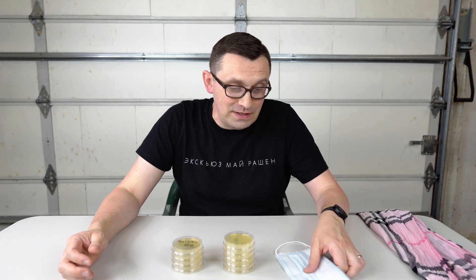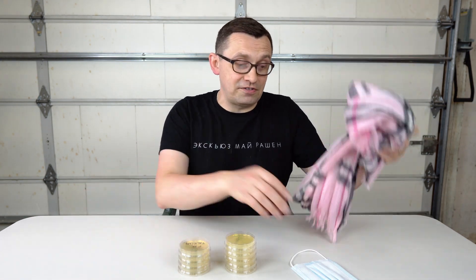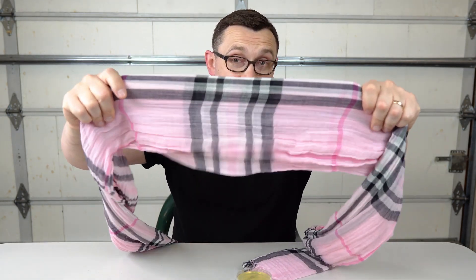Hello everyone, how are you all doing? Just recently, one of the hospitals here in town made an experiment on how effective face masks are. So I decided to test this experiment out and see if I can get the same results. But I actually want to expand this experiment and include the scarf along with the face mask, because I've seen quite a few people in stores wearing scarves instead of masks. So I decided to test it out and see how effective scarves might be.